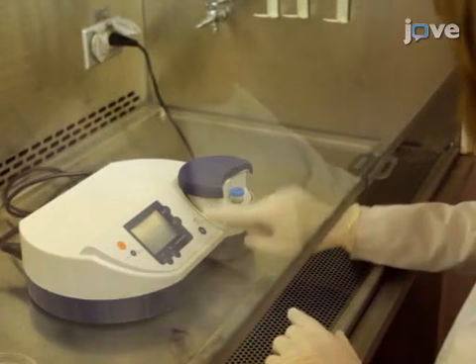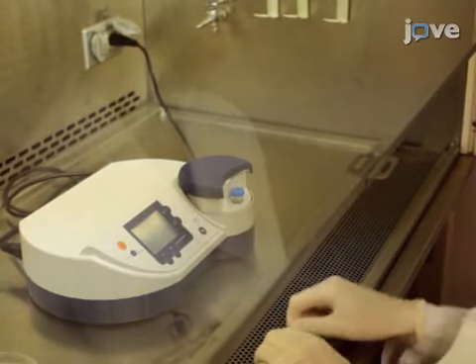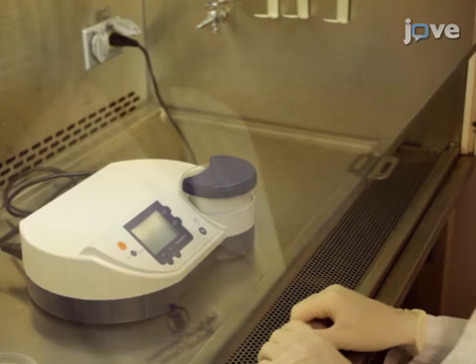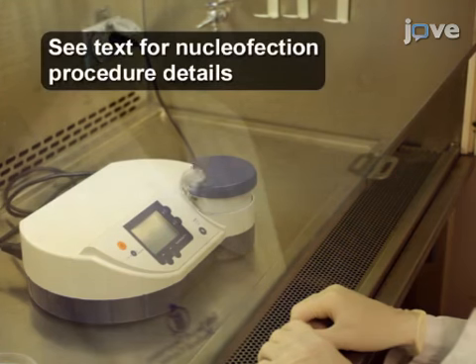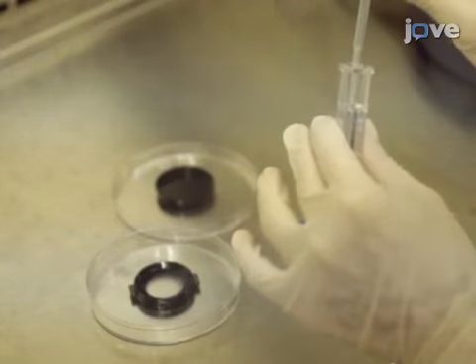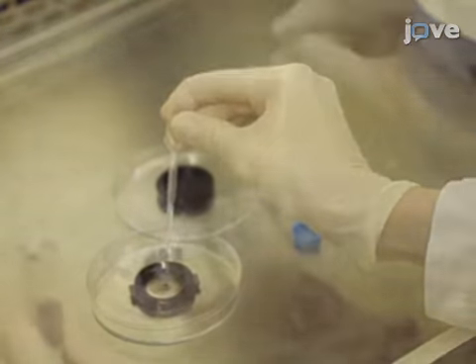Begin by co-transfecting primary human lung or dermal microvascular endothelial cells with membrane YFP and soluble DS-RED via nucleofection, and plate the transfected cells onto live cell imaging culture plates.